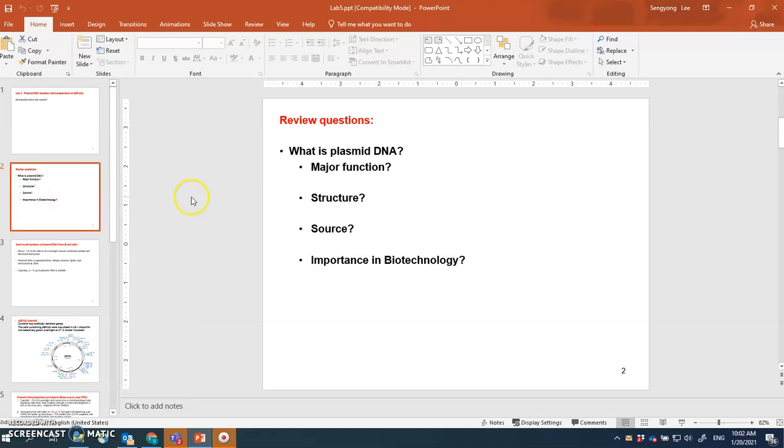Okay, so what is plasmid DNA? I'm hoping you probably would have done your lecture already. The lecture, probably it's 5, talks about the genomic structure of prokaryotic cells and eukaryotic cells. When it talks about the genomic structure of the prokaryotic cell, it talks about circular chromosomal DNA as well as the presence of plasmid DNA inside of the nucleoid area.